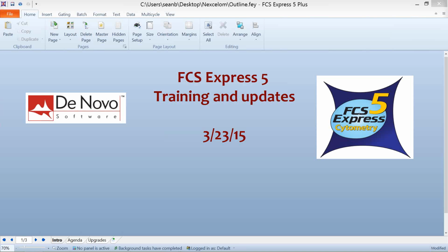And yeah, again, I'm glad everybody could join us today to learn a little bit about FCS Express 5 and kind of what we've been up to in the last little bit with releasing the software. I wanted to talk a little bit about upgrading customers and the process for doing that for the Nexcelom customers who currently have version 4.